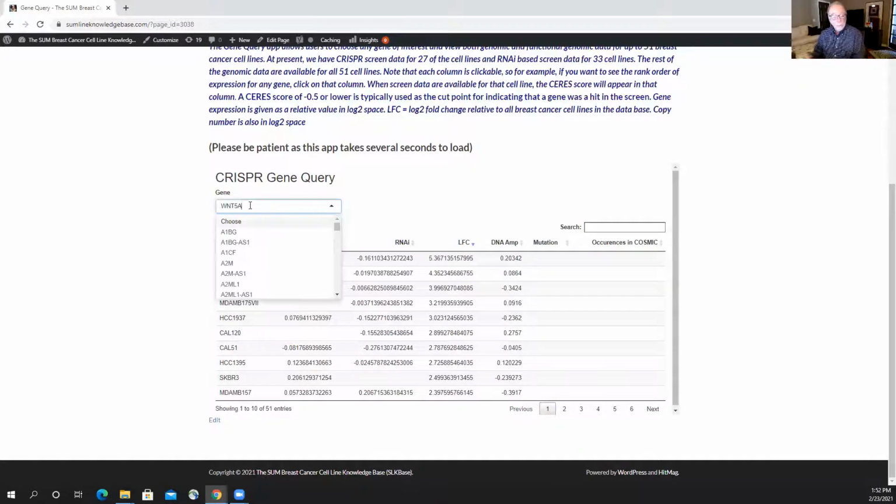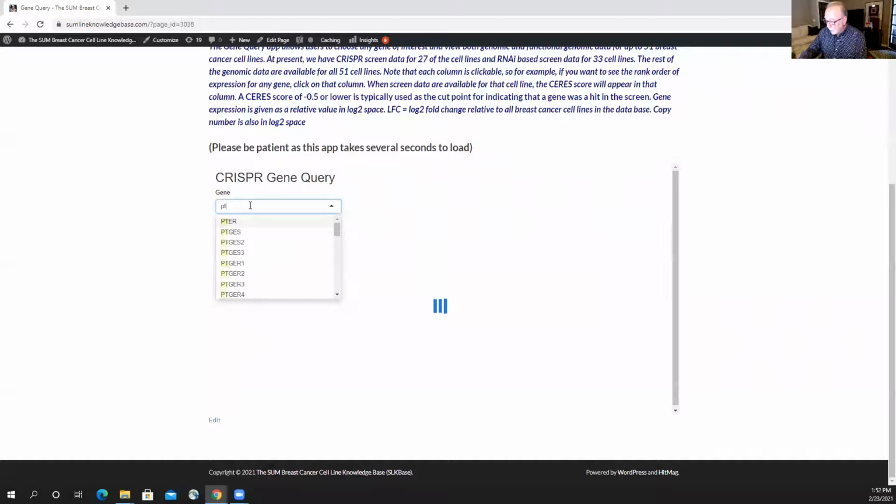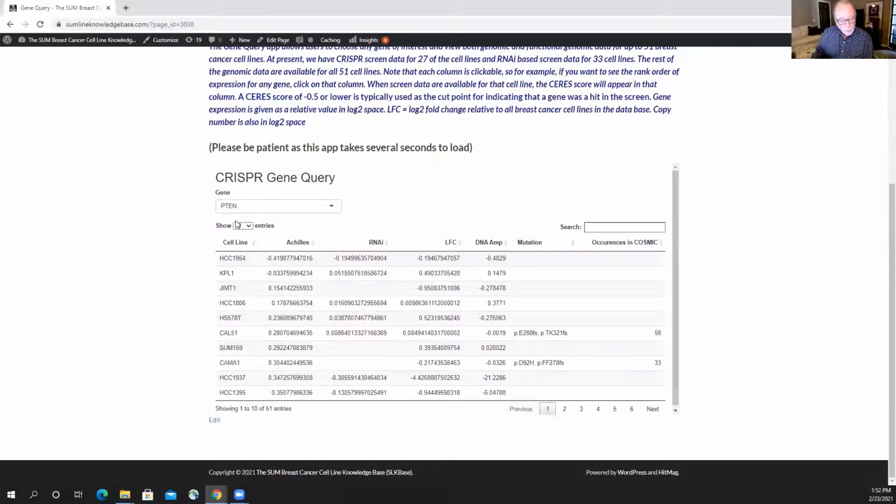The same is true for PTEN. This is really an interesting one, right? Because PTEN is sometimes mutant, as shown here, and sometimes those mutations are associated with a complete lack of expression, but sometimes the gene is actually disrupted in a way where it's wild type, but there's no message at all. And so there's essentially no expression of the gene at the message level. So you can identify all of these right away by looking at mutations versus expression and so forth.